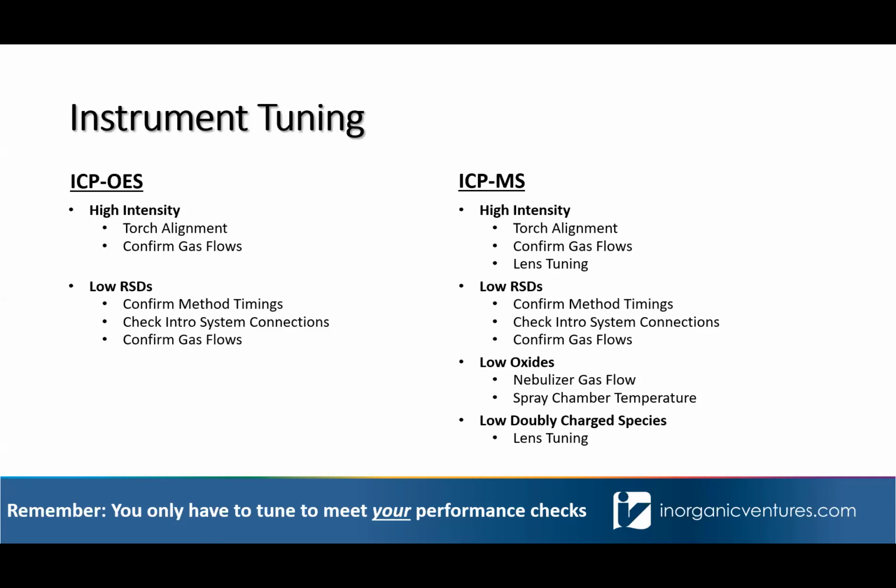All right, so what I've given here are ways of troubleshooting your tuning to ensure that you're getting adequate performance from your instrument. You can spend a lot of time tuning when it's not necessary. I want you to remember here that your tune only has to meet your performance checks. So if you don't need a highly tuned instrument, don't spend your time tuning when it's not part of your performance. Your method validation activities should give you an idea of what performance you should expect for your instrument.